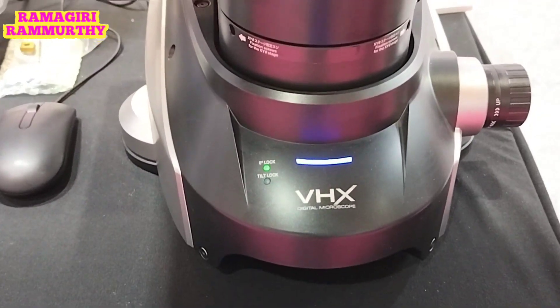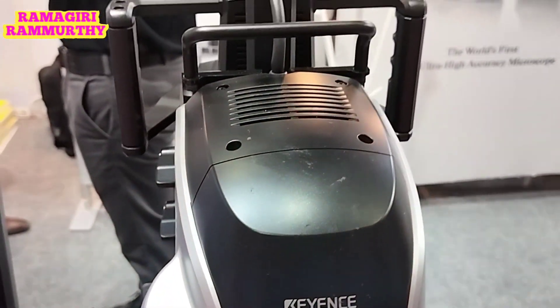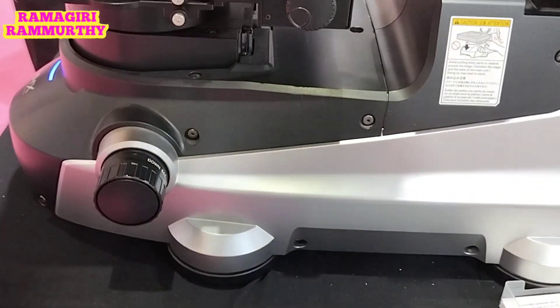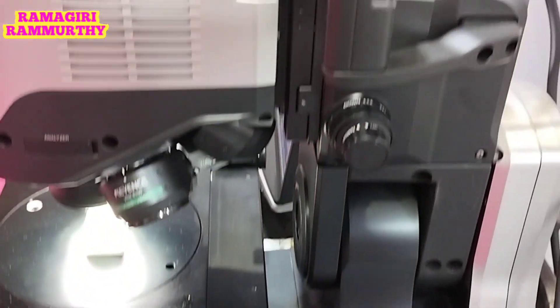The price is around 50 lakh. This is a Japanese-based digital microscope.